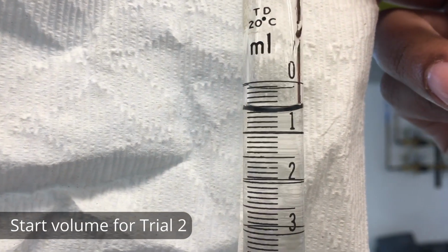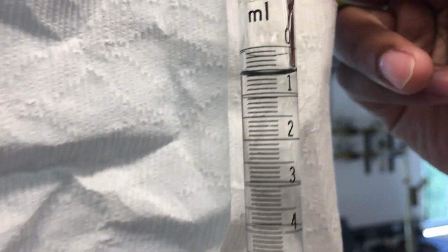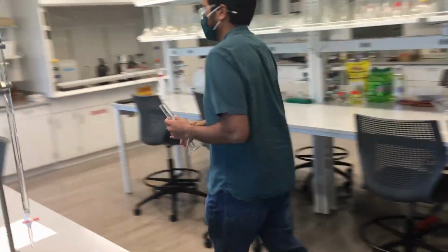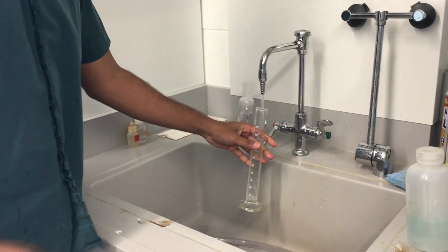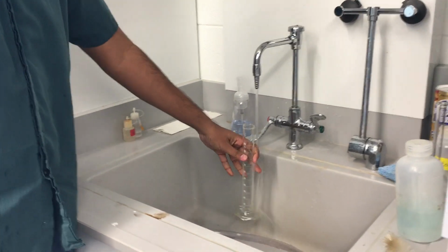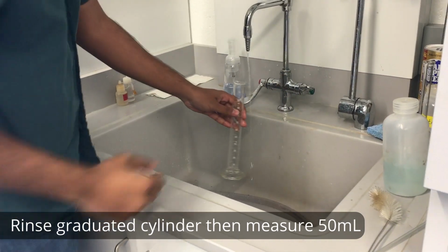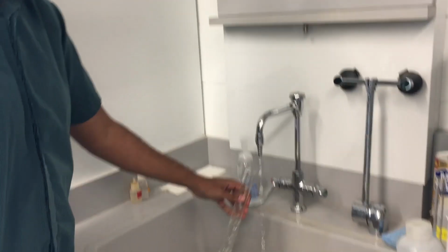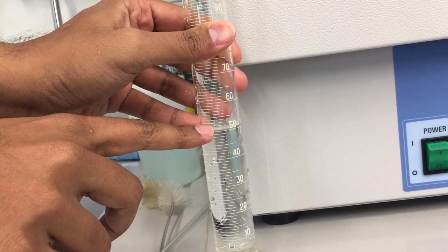Now we'll start again. I've filled up the burette with EDTA solution to start up part 2, in which we're going to go ahead and test the hardness of our Georgia tap water. So now that we know the concentration, or we've calculated the concentration of our EDTA, I'll just go over here and open up our tap and fill up about 50 milliliters of our water into this graduated cylinder after washing it a few times first. So you see about 50 milliliters of our tap water.